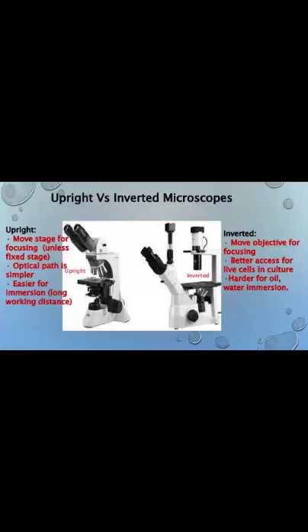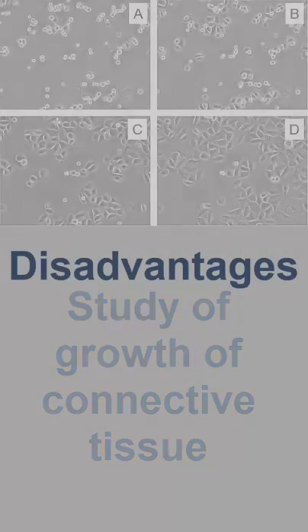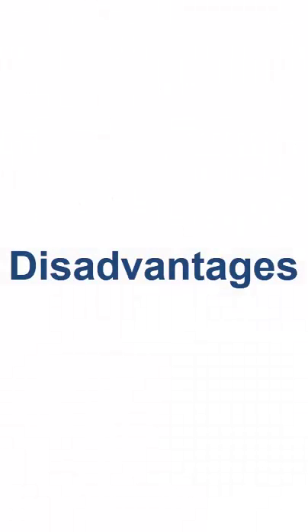The larger specimen or culture may be kept in a large petri dish for viewing instead of a slide. In a large container with an appropriate cover, there would be naturally less evaporation and more gas exchange to maintain life. This is not possible when a thin specimen is placed under a cover slip on a slide, where evaporation happens too quickly.